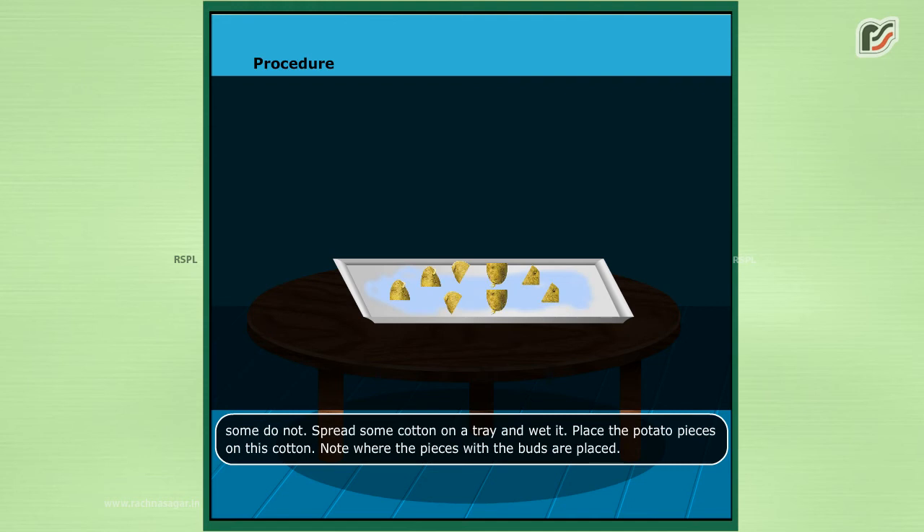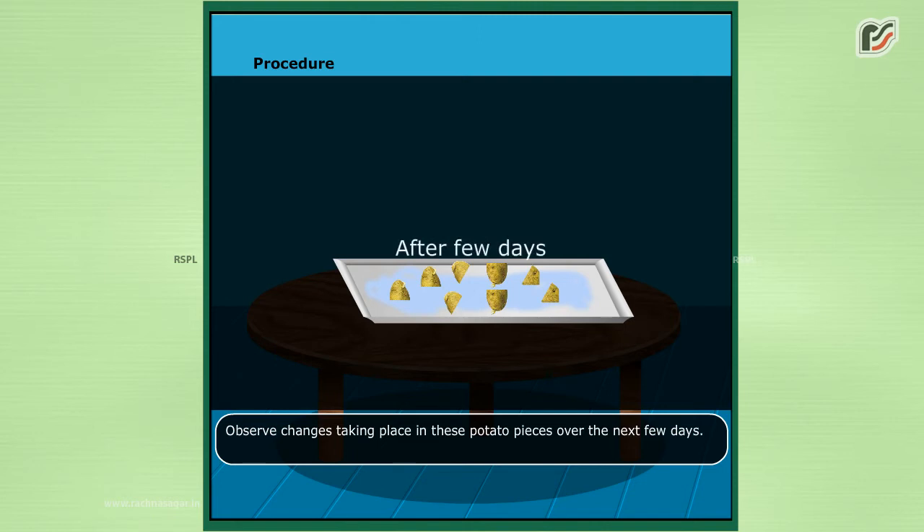Place the potato pieces on this cotton. Note where the pieces with the buds are placed. Observe changes taking place in these potato pieces over the next few days.